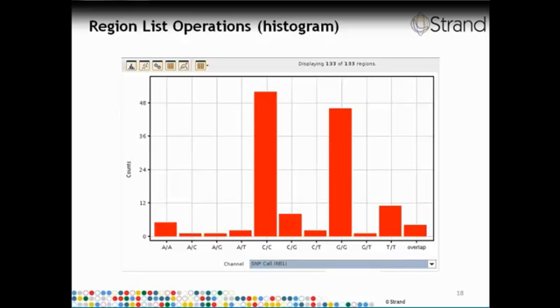Even though the number of reads spanning the reference location is large, the score assigned to that particular variant seems to be quite low. To understand these patterns better, we can color and shape and size the points in the scatter plot by different attributes. So one reason why the score may be low is that the percentage of supporting reads may be low. Similarly, the MiSeq SNP analysis software assesses if the SNP is supported by reads on either strand. So one can also try to plot the strand bias.